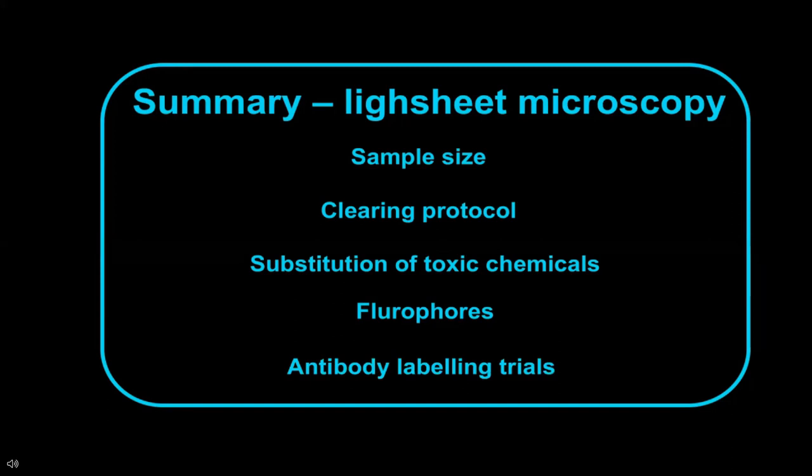And antibodies will not always work with the clearing protocols, so each antibody has to be tested. It can also be an idea to test several antibodies in parallel.